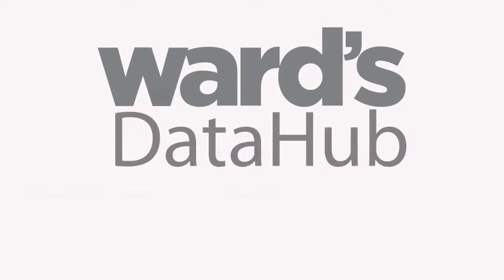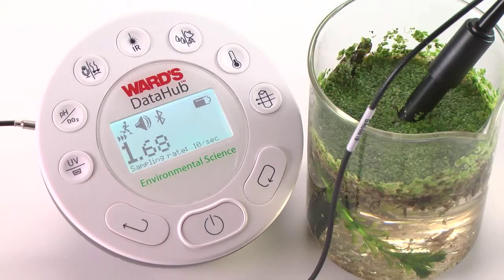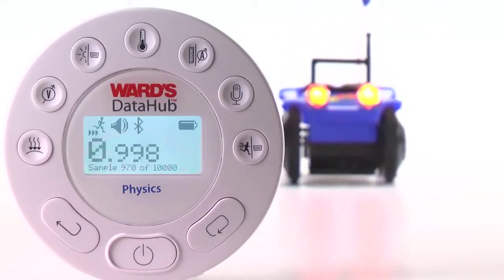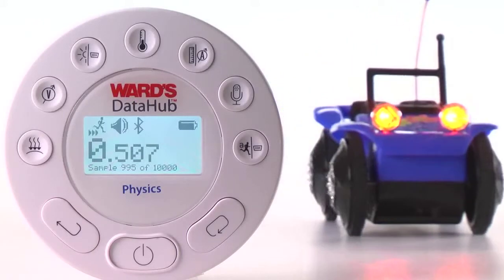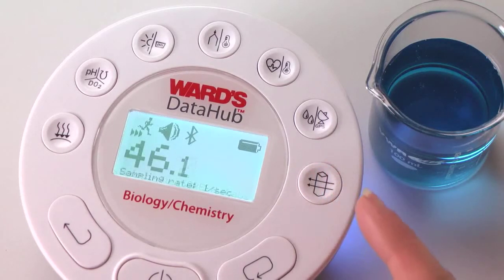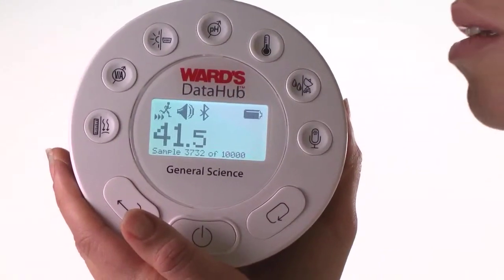Introducing Ward's Data Hub — the power of 12, the convenience of one. It's the only wireless all-in-one probe wear system designed for high school and middle school classrooms. With Ward's Data Hub, it's easier than ever to incorporate probe wear into the hands-on science lessons you already teach, resulting in faster, more powerful data analysis with every lesson. Just a single unit provides access to 12 or more built-in sensors.